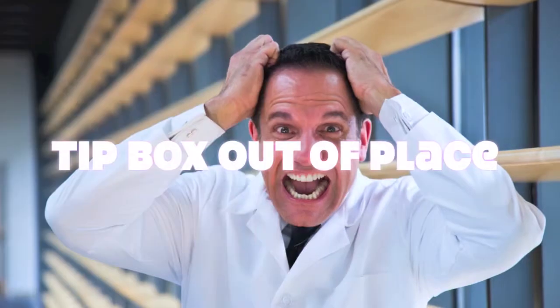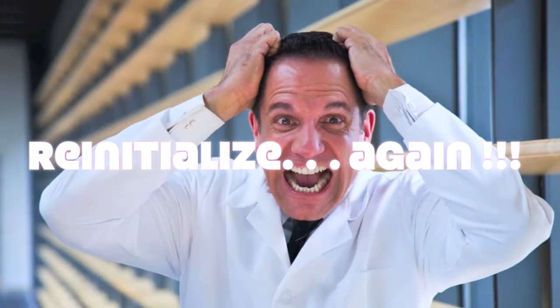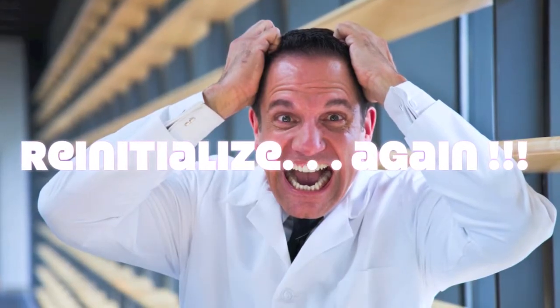If you've ever experienced setting up a run and something has been out of place where the system crashes, you know what it's like to completely set up the entire run from the beginning again because you've had to reinitialize the robotic liquid handling robots.